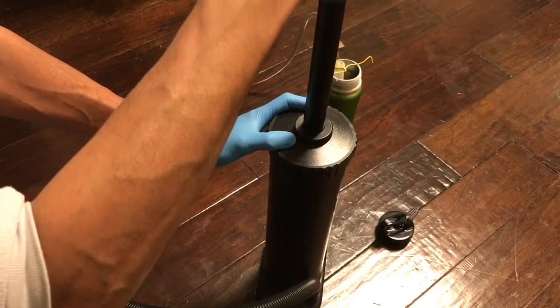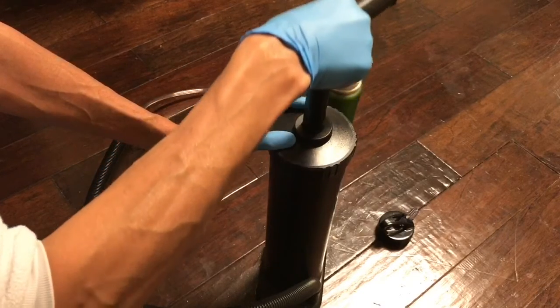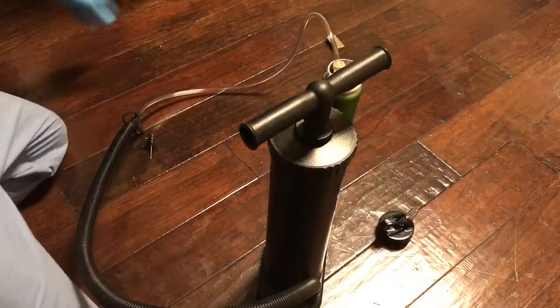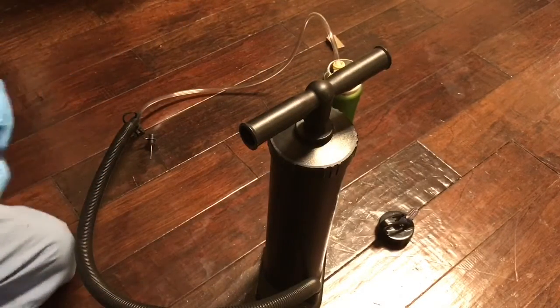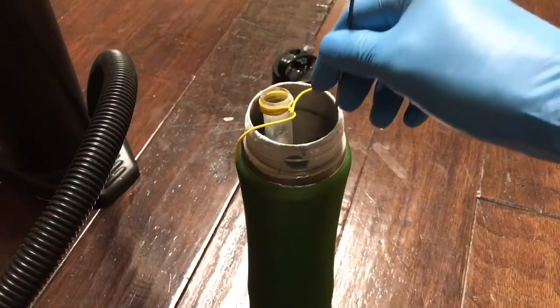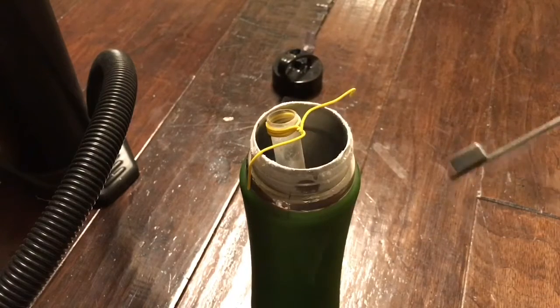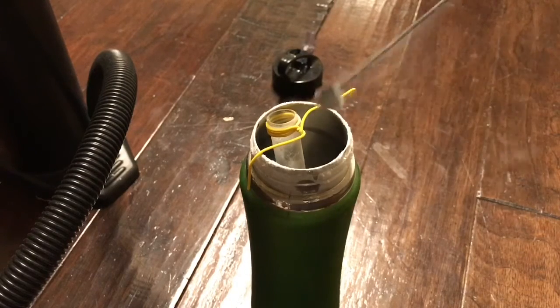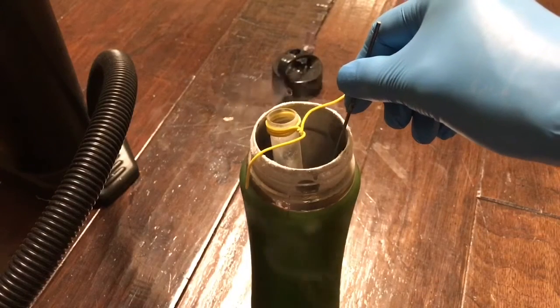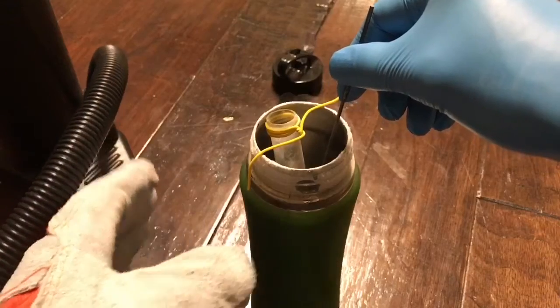The first test I'm going to do is test its paramagnetism. Liquid oxygen is known to be attracted to magnets weakly because it's paramagnetic, so let's test that. I have a magnet here — as you can see it does not attract liquid nitrogen.